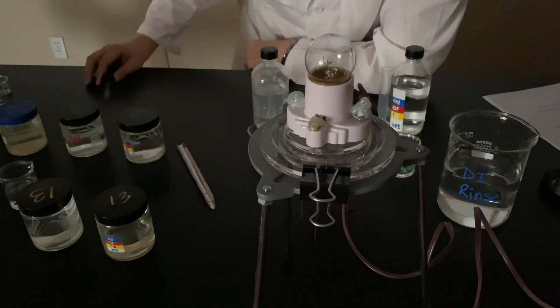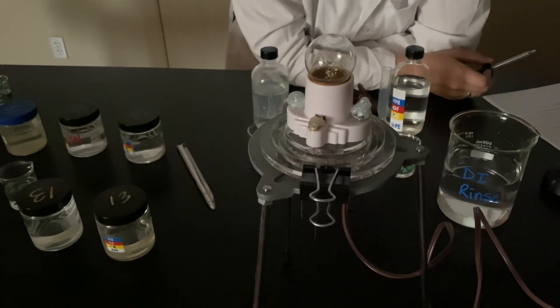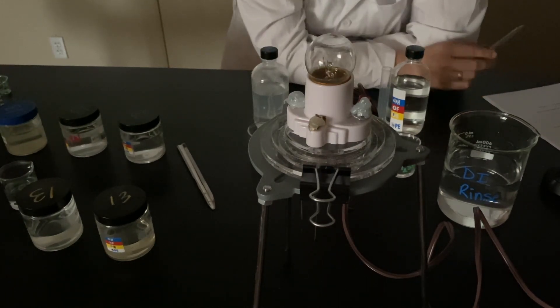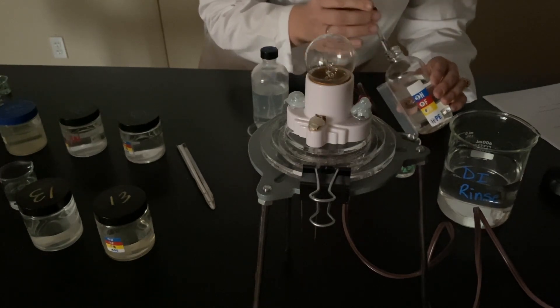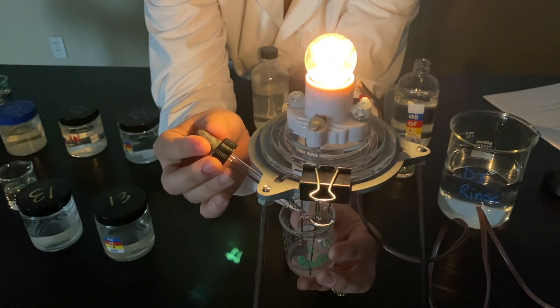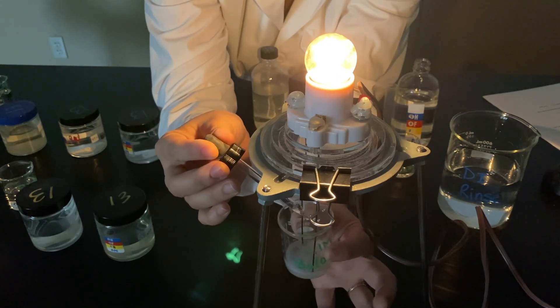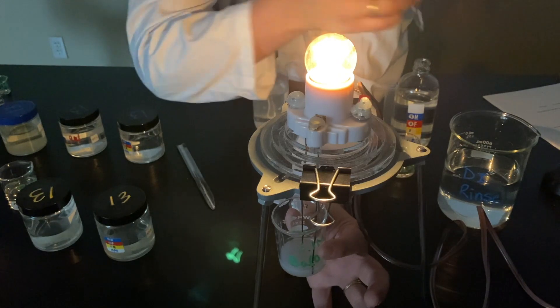Now comes the interesting part. Our directions tell us to hold the beaker with 0.1 molar barium hydroxide in the electrodes and add drops of 0.1 molar sulfuric acid until the reaction is complete. I've got my little dropper here for sulfuric acid — this is why I didn't want to add a lot. Here we go, starting to add sulfuric acid, and you can see on the screen the solution is definitely changing color. We're absolutely getting a precipitate.